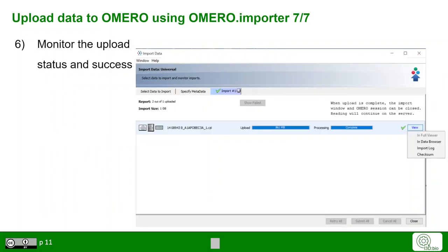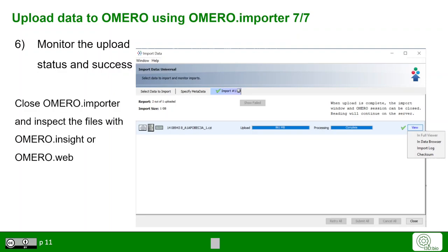You can now monitor the upload status and success in the upload window. After that, you can close the Omero Importer and inspect the files either in Omero Insight or in Omero Web.